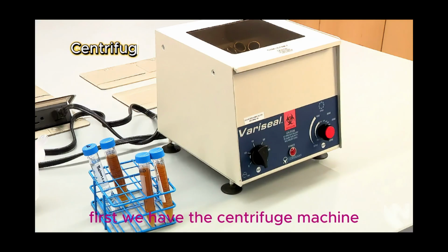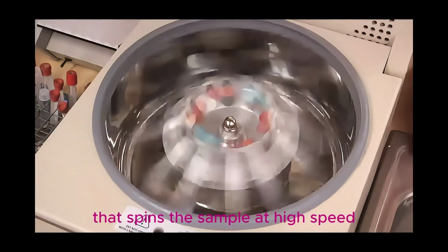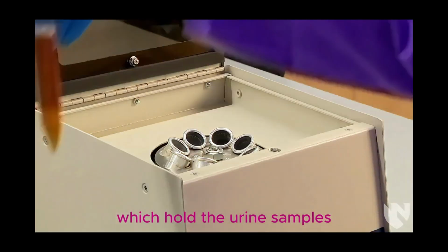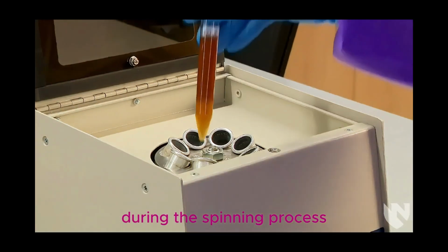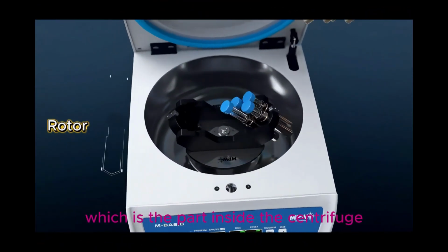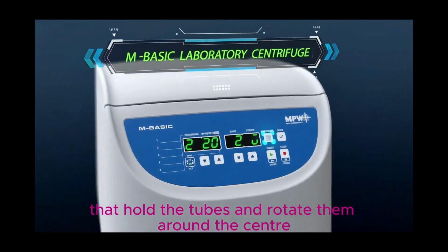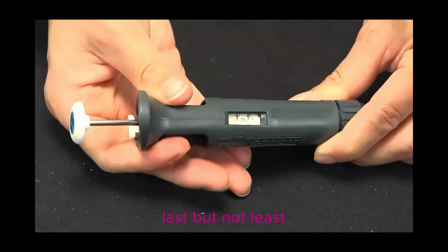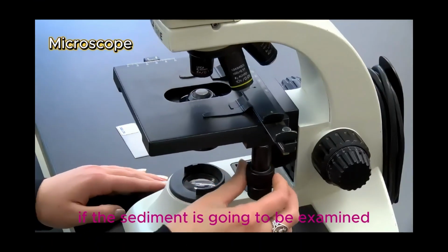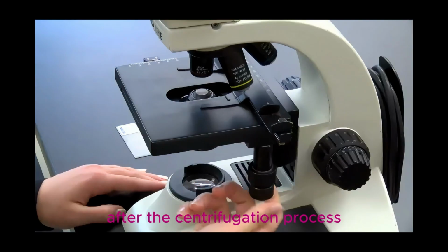First, we have the centrifuge machine, which is the main instrument that spins the sample at high speed. Next are the centrifuge tubes, which hold the urine samples during the spinning process. Another important component is the rotor, which is the part inside the centrifuge that holds the tubes and rotates them around the center. Last but not least, we also need a pipette and a microscope if the sediment is going to be examined after the centrifugation process.